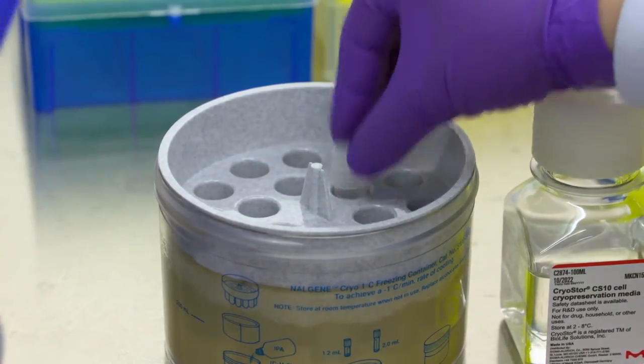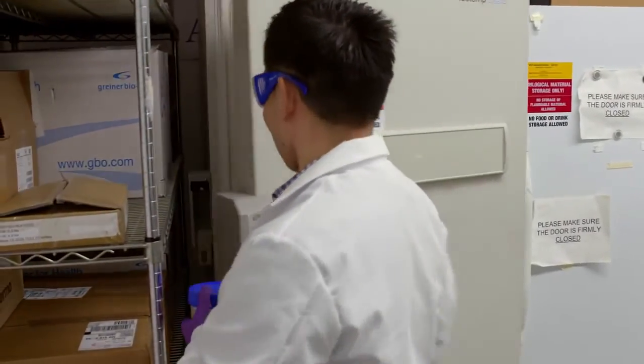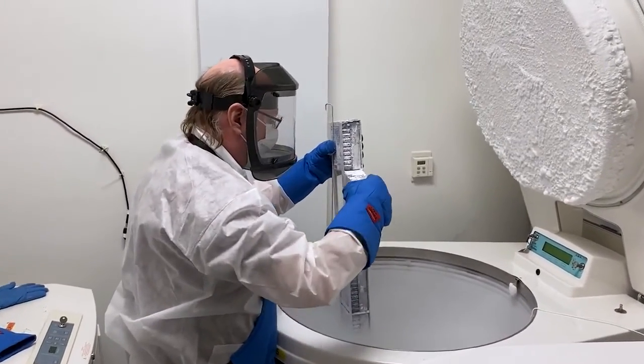Transfer tubes to the freezing container and place the device in a minus 80 degrees Celsius freezer overnight. The next day, quickly transfer cells into liquid nitrogen for permanent storage.